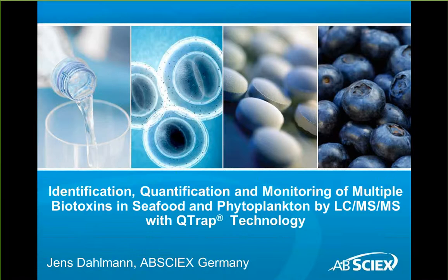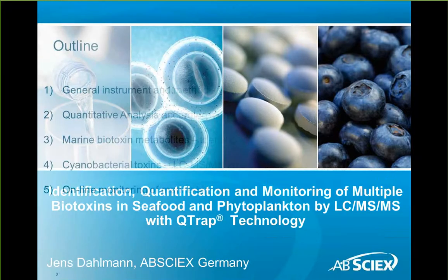And in various places of this continent, we have the issue of toxic phytoplankton blooms. We are utilizing our LC-MS technology for the quantitation of these toxins, but also we are utilizing QTRAP for confirmation and identification of this toxic cocktail.